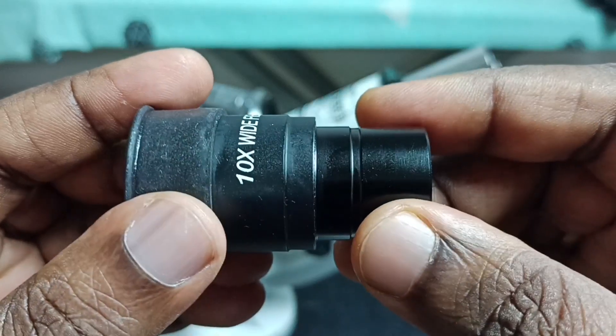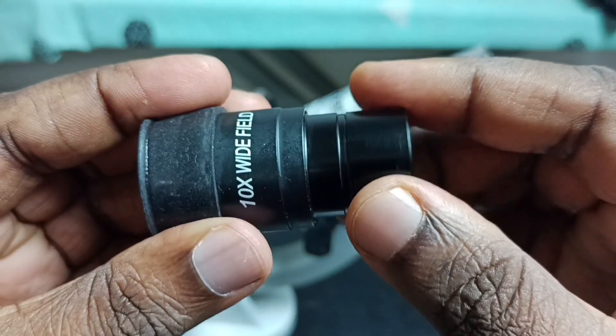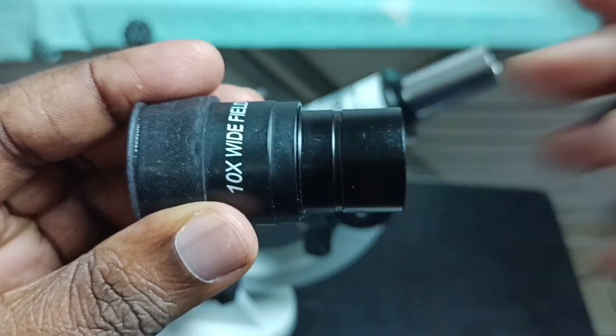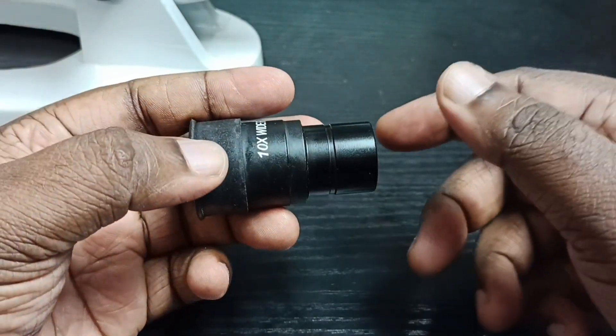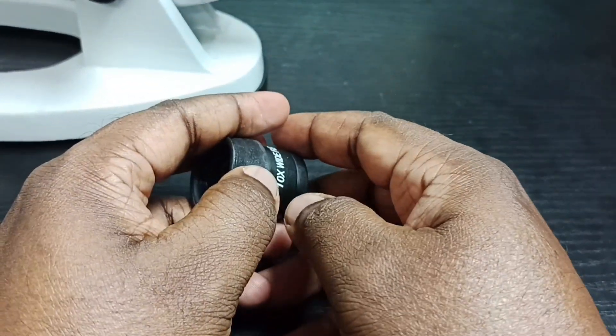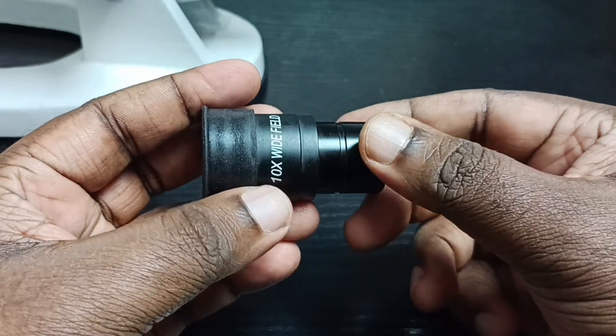So this is a 10x lens. We can open it first — let me open this part.